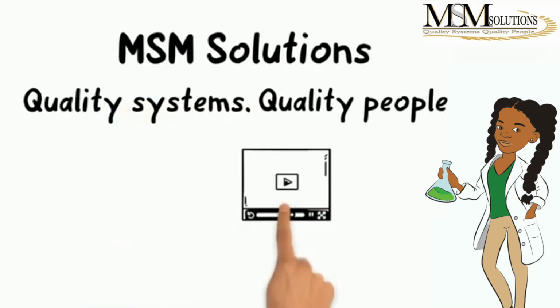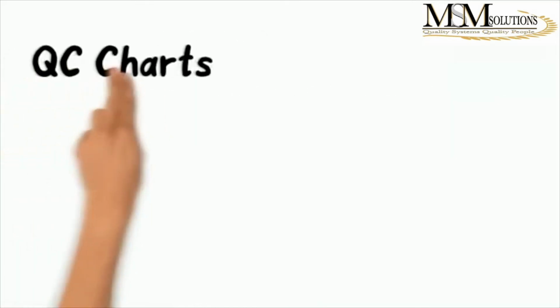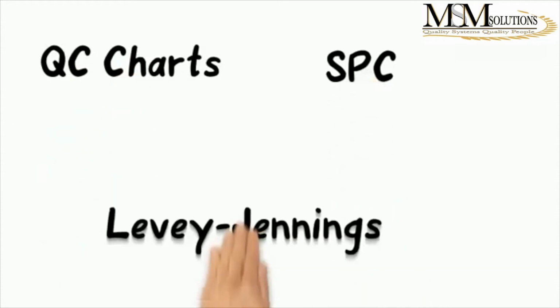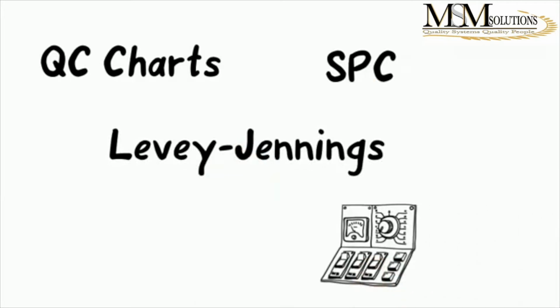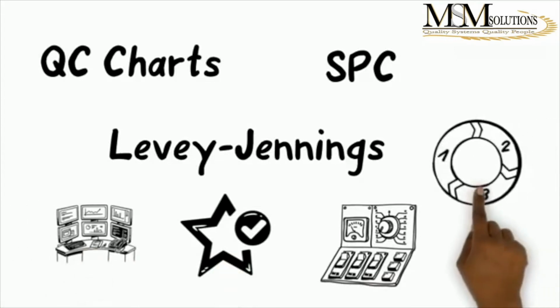In this video, we'll be talking about control charts. QC charts are actually SPC charts, and in the lab, they are Levey-Jennings charts. What does that mean? What is an SPC? SPC is statistical process control. It is a method of quality control which employs statistical methods to monitor and control a process.